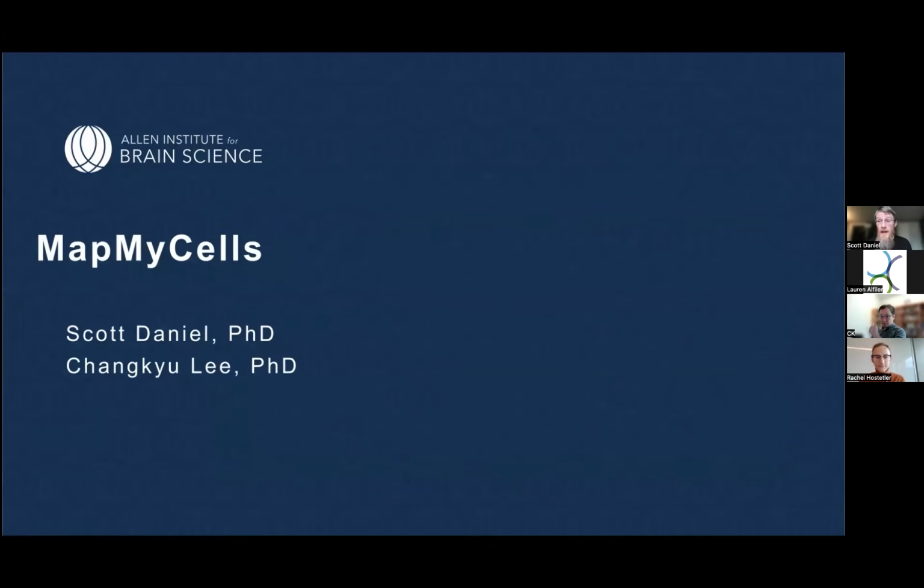Okay. Hi, my name is Scott Daniel. I'm a data scientist here at the Allen Institute, and I am here to talk to you about what MapMyCells is. In the most cartoonish way imaginable, MapMyCells is a tool that we put out in autumn of 2023. My colleague CK Lee is here with me to answer any questions that I can't answer because either they involve a part of the design process that I wasn't involved in or because they involve the R language. Full disclosure, I am first, foremost, and always a Python user.